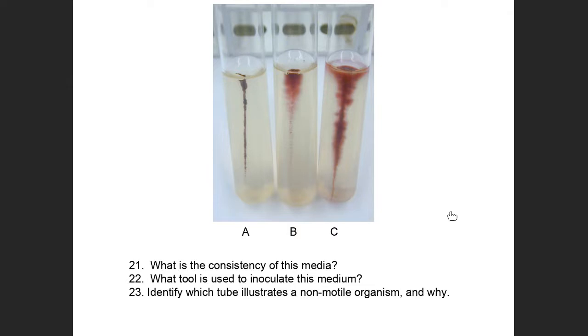What tool is used to inoculate this medium? And of course, that is an inoculating needle. You could say needle or just needle. You could say straight needle, that would be fine. But I don't want to hear a pokey thing, or see somebody say a straight thing. You need to tell me it's a needle somehow or another. Okay? If you say it's a loop, it's not correct, right? A loop is not used for this technique.